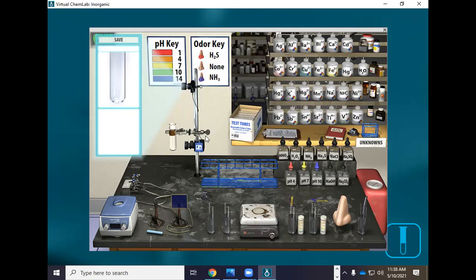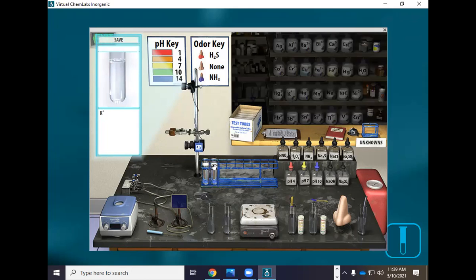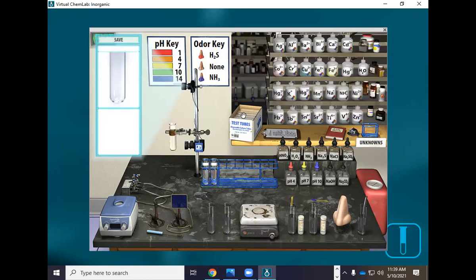So they told me they want me to do sodium first. Okay, so my sodium is, where is that? Right there. Okay, so now I have sodium in here. And then I can take this and put it in my rack. And if I double click again, then I will get potassium in there. And then I can just take my potassium and put it in the rack. And then they want me to do a mixture. So I can click and get some sodium in the mixture.